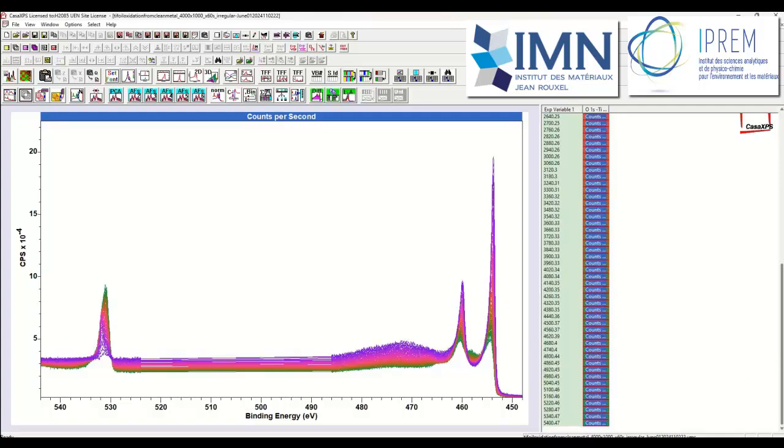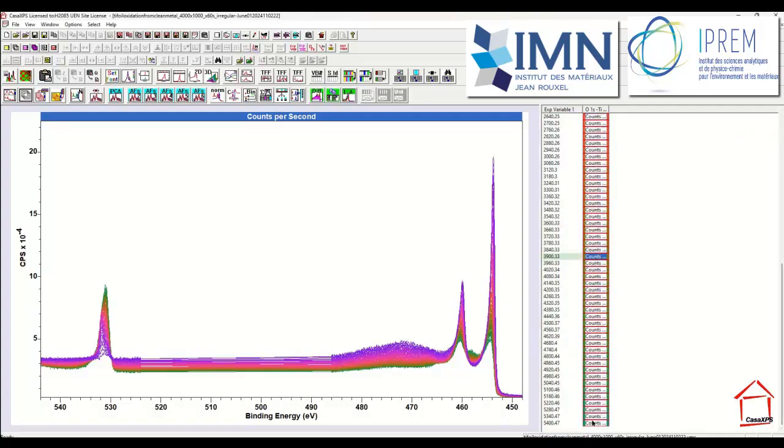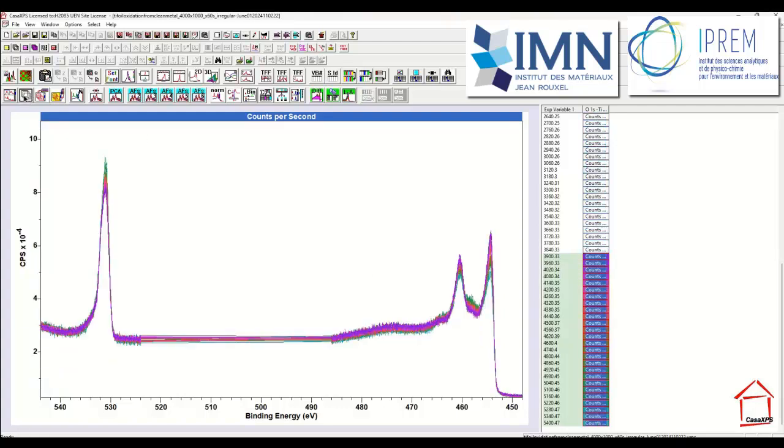And I might guess that the end of this experiment, where the oxide has formed to a greater extent, might be representative of spectral shapes that actually sit in a two-dimensional space. And we can test that hypothesis by applying the PCA calculation to a subset of these data.